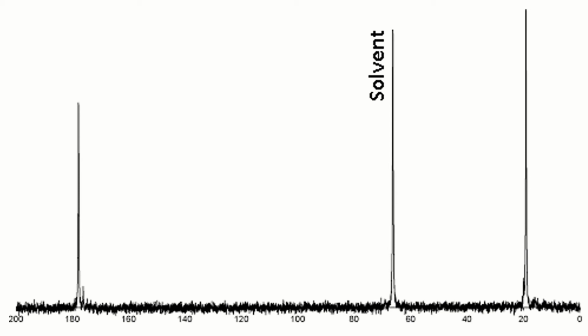It's a little bit overwhelming to start with these three graphs and no more information than that, but you can use your skills to identify the compound. You will jump around from graph to graph, backwards and forwards, and eventually you will be able to figure out what it is, and with some checking, be pretty confident of your answer. So I usually like to start with the 13C NMR just because it's nice and straightforward.